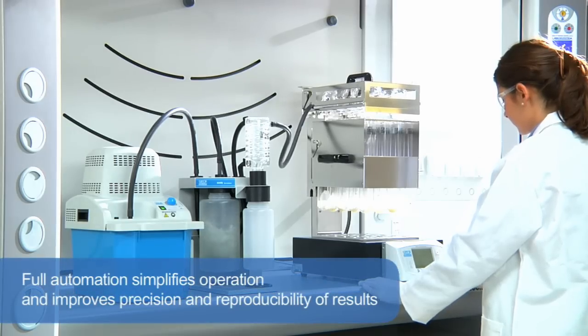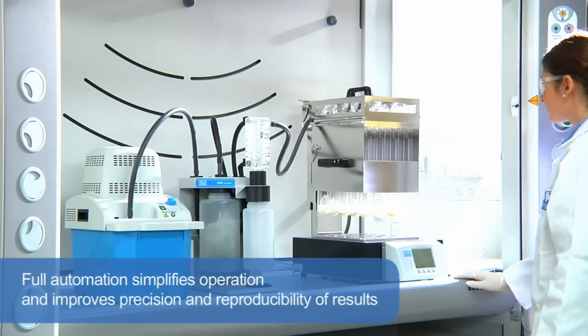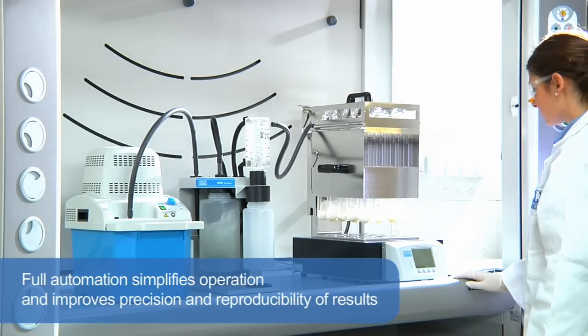Full automation simplifies operation and improves precision and reproducibility of results. Once the samples have been loaded, the rack automatically lowers them into the heating block.